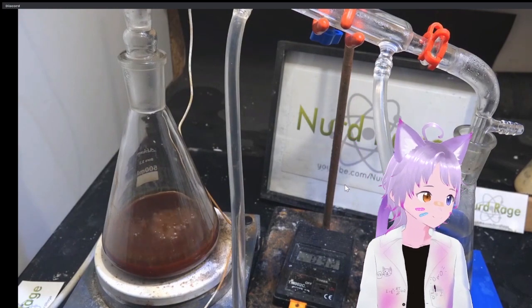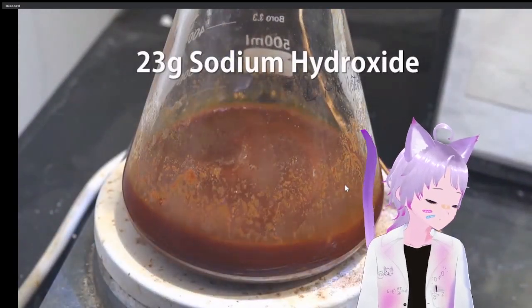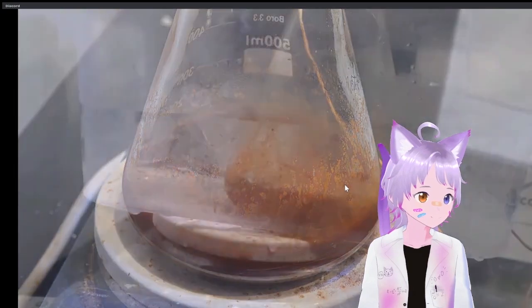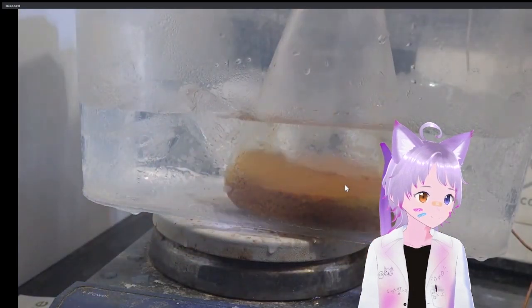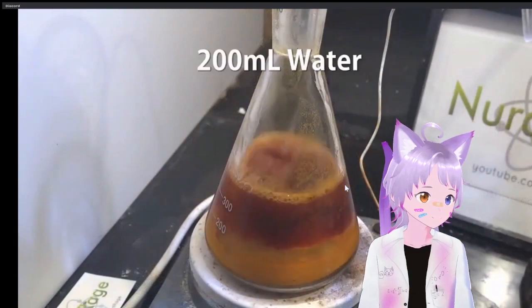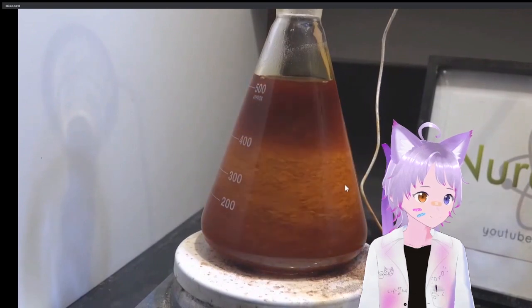Now turn off the heating, let it cool. Now we add in 23 grams of sodium hydroxide and stir. I want to make the water even more polar so it will absorb all the highly polar impurities but reject the non-polar impurities. Now place the mixture on an ice bath and let it cool. Once it's cold, we add in 150 milliliters of diethyl ether that I extracted from starter fluid. Add in another 200 milliliters of water and let it stir for about half an hour. Turn off the stirring and let it settle.